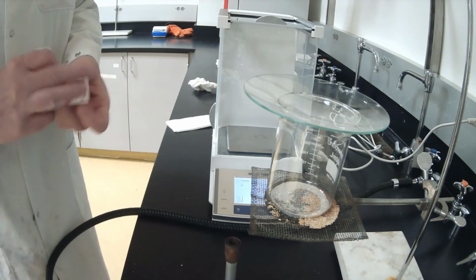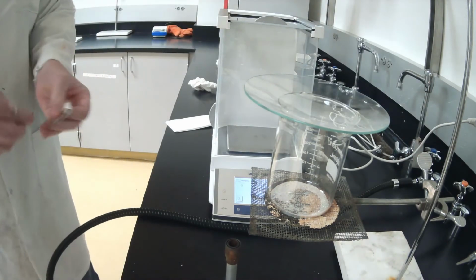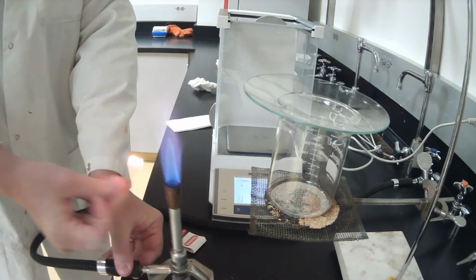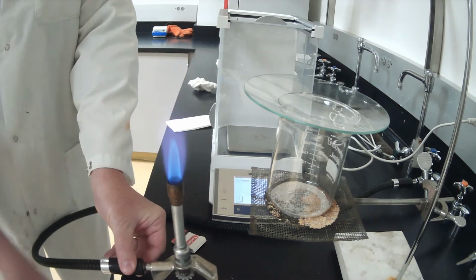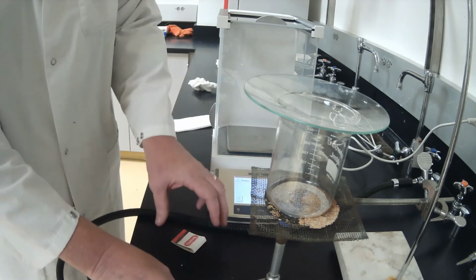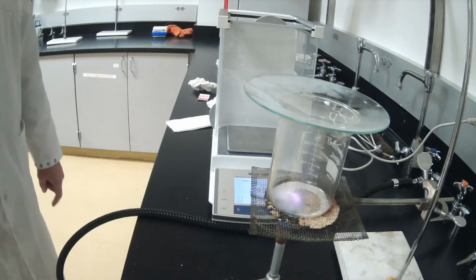To light with the matches, again, you turn on the main spigot, strike the match, and you very carefully bring it to the edge of the Bunsen burner. And it should be the same flame that we had before. And we're now ready to cook the bottom one last time. Today is a very humid day.